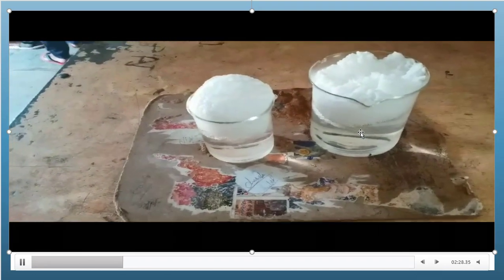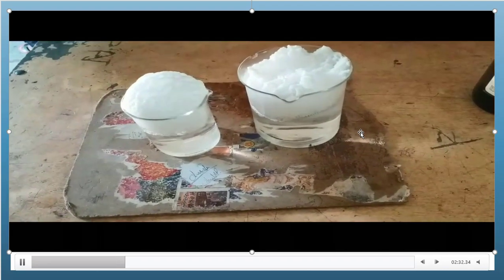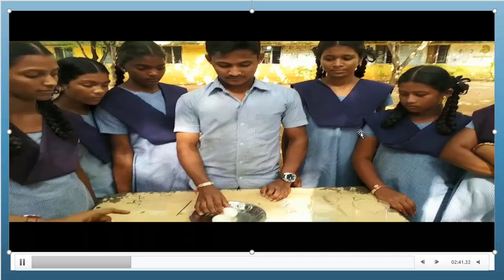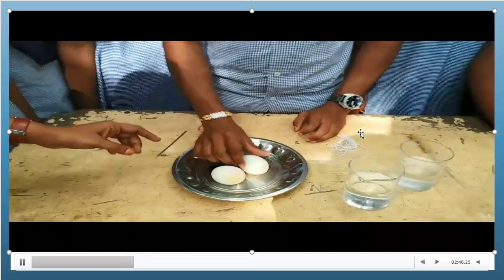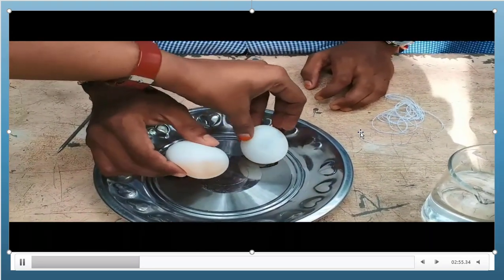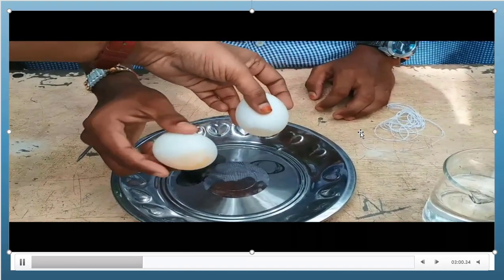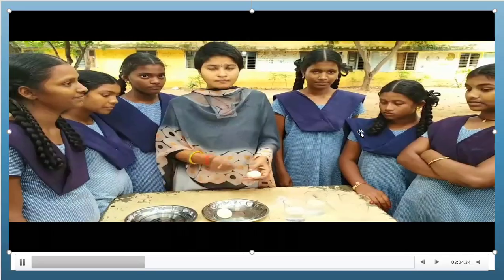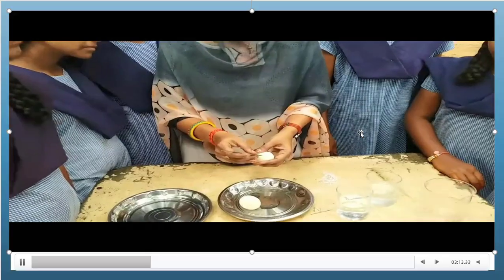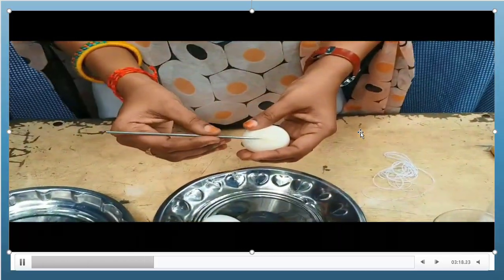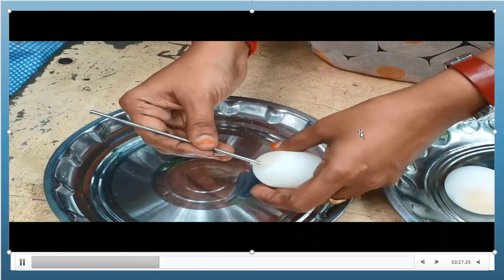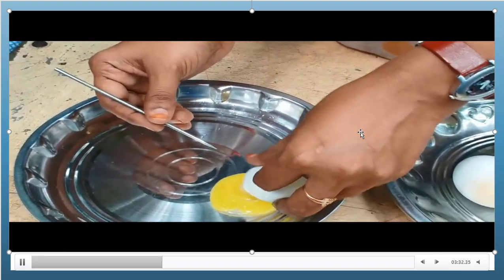The complete eggshell should be removed entirely. Once the eggshell is completely removed, you will observe the eggs without shells — they look like balls and are flexible. Now, what we have to do is take out the inner or visceral part of the egg. For that, we have to make a hole in the egg very gently; otherwise the membrane will break.